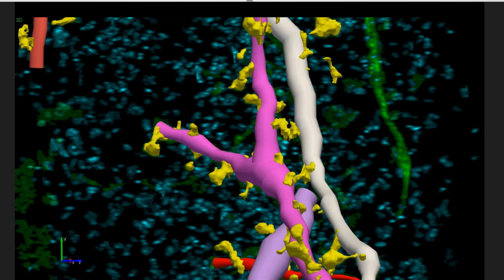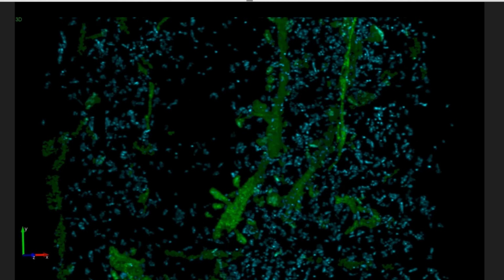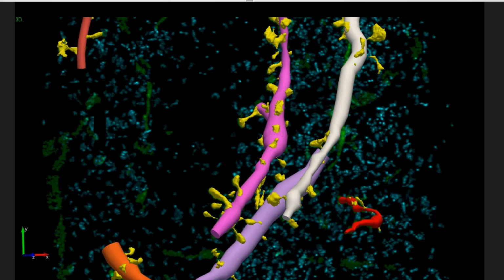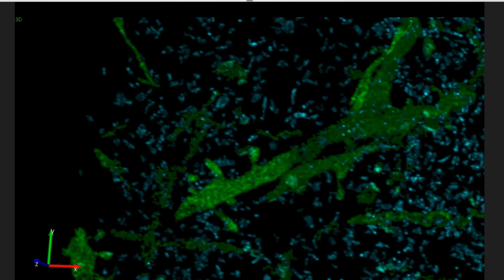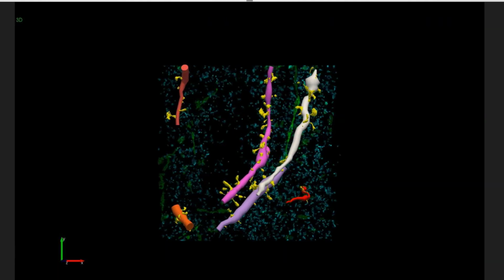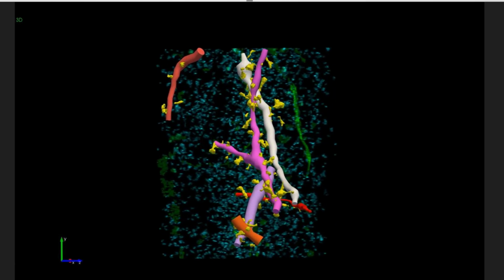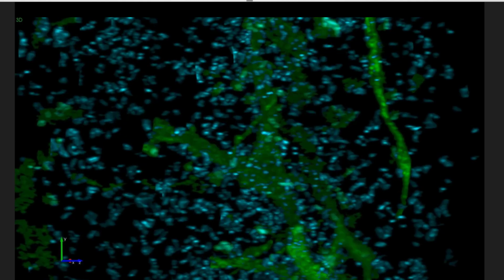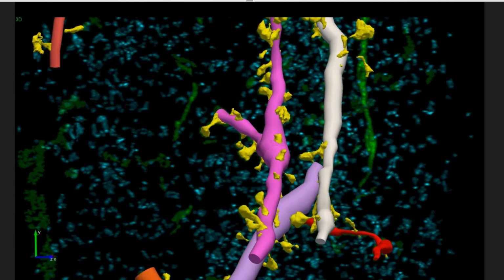And this is a piece of tissue that was isotropically expanded. My colleague Julie McMullen and I worked on this, and this was quite the project, but this is just a small subset of the data that they had acquired. As we watch the video, we can see the data rotating, and we can see immense detail in the image data. And this is all thanks to the usage of expansion microscopy, as I said. With this, we can get incredible detail without the need for electron microscopes, and this strategy allows researchers to collect information at the nanoscale while viewing it at what would be the microscale.